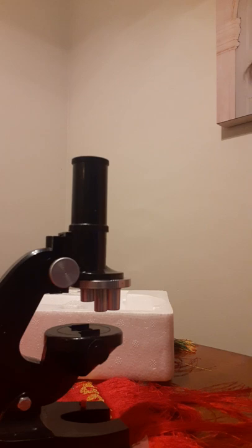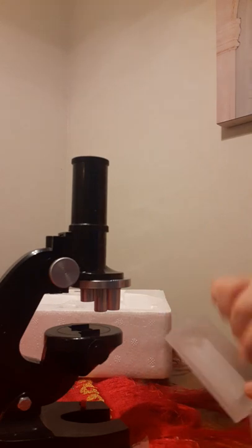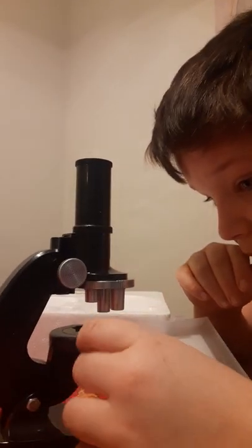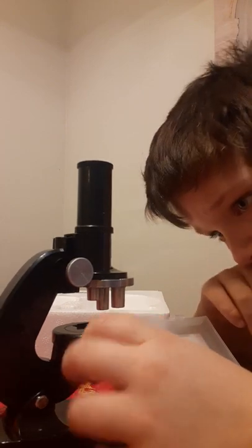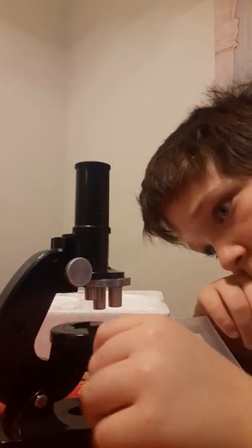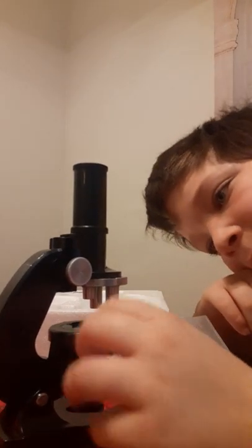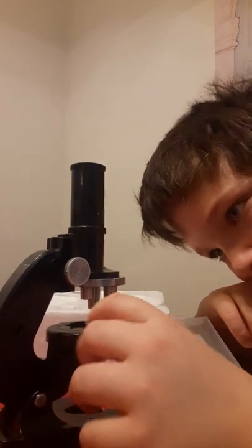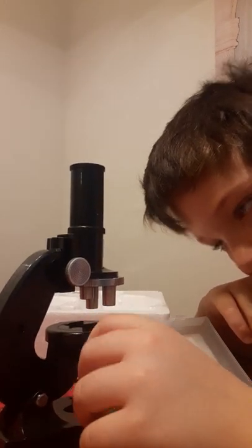So you have the slider right here. These are little hairs, I don't know what they are. So basically you want to set this up like so. You want to get this one in, and then you want this one.